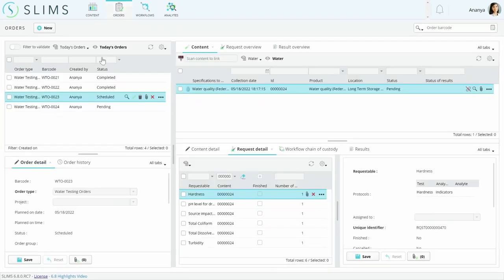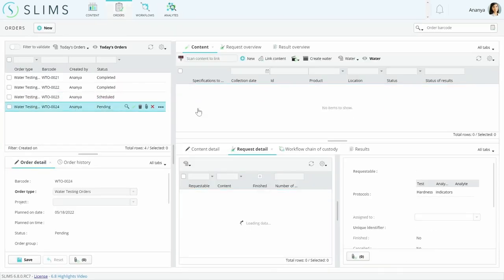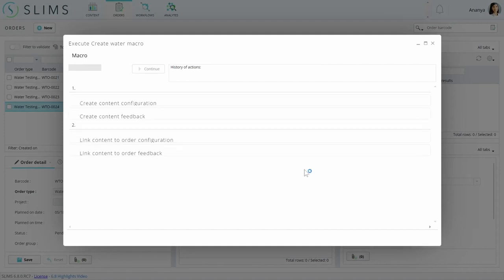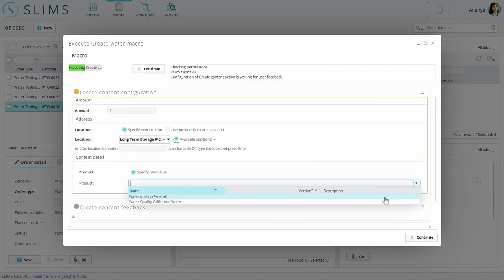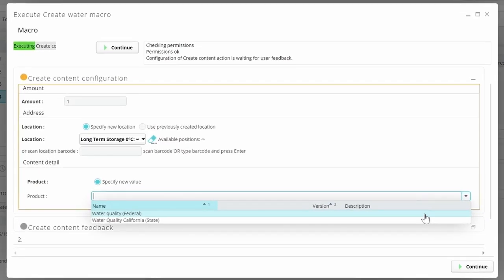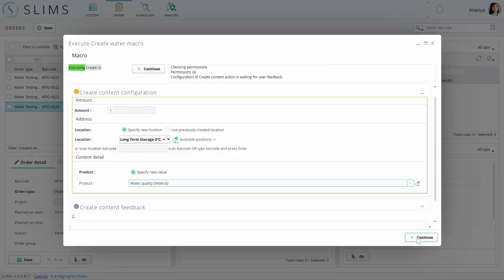This comes into play when you request the specifications to measure in an order. Our Water Quality Federal product has a specification that uses each analyte.